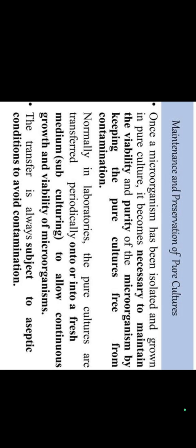Good afternoon to all. Today we have to discuss maintenance and preservation of pure culture.